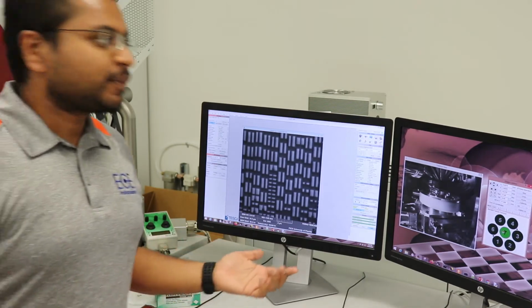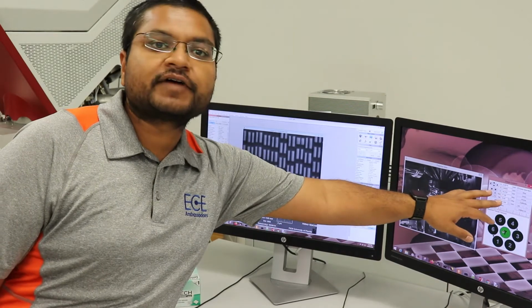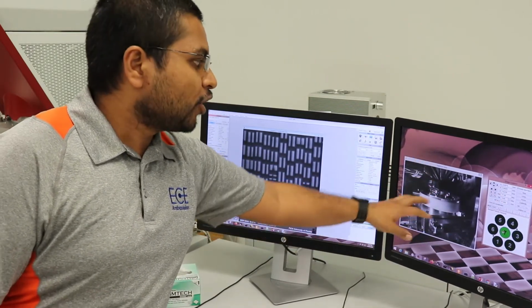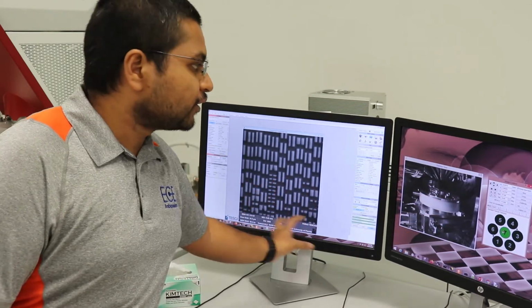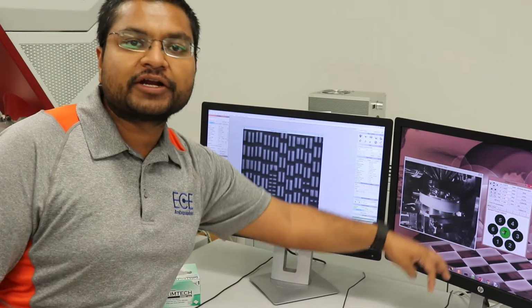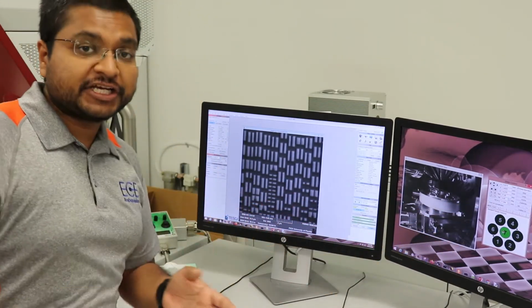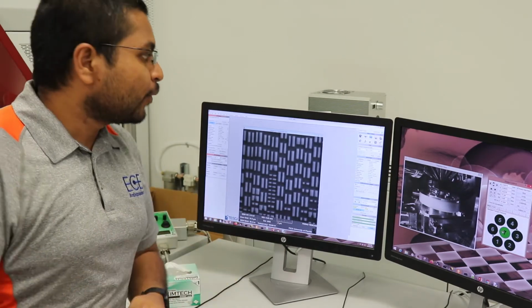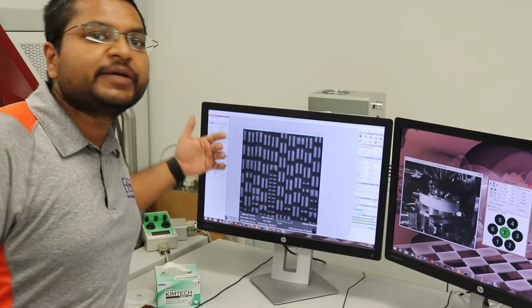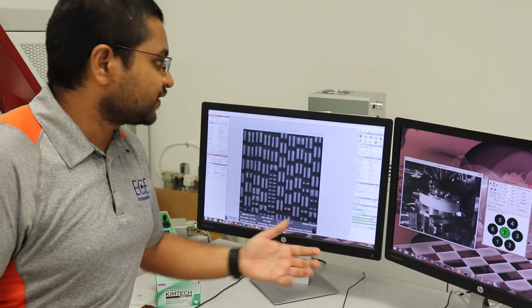Let's come to the specific parameters we are using in SEM. A couple of parameters are the stage movement X, Y, Z, which lets your stage move around to different locations of the sample. You can tilt your sample based on your requirement. You can rotate your sample based on your requirement. And some of the imaging parameters you can change to look at your sample more clearly is your voltage. If you use a high beam voltage, you can go deeper inside your sample. You can look deeper inside your IC, your integrated circuit.